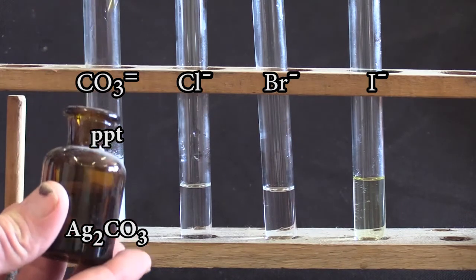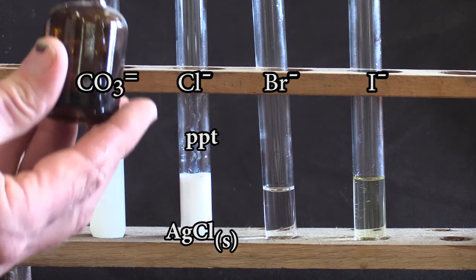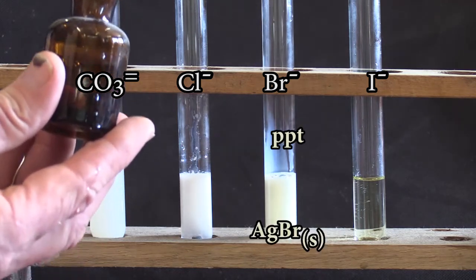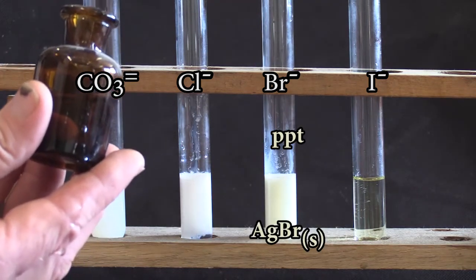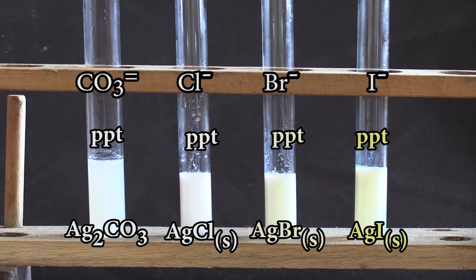Similarly with the halides: silver chloride precipitate, silver bromide, which is slightly off-white, and silver iodide, which is the yellowest of the three.